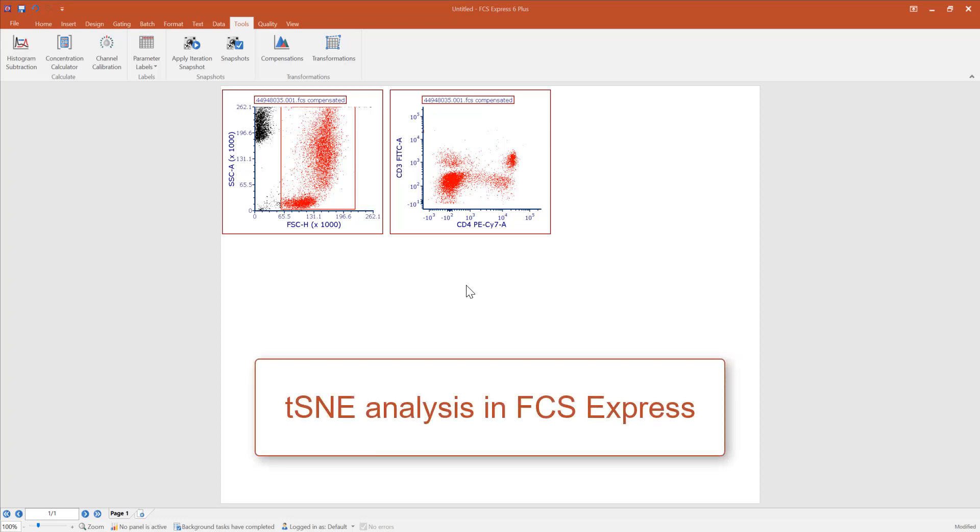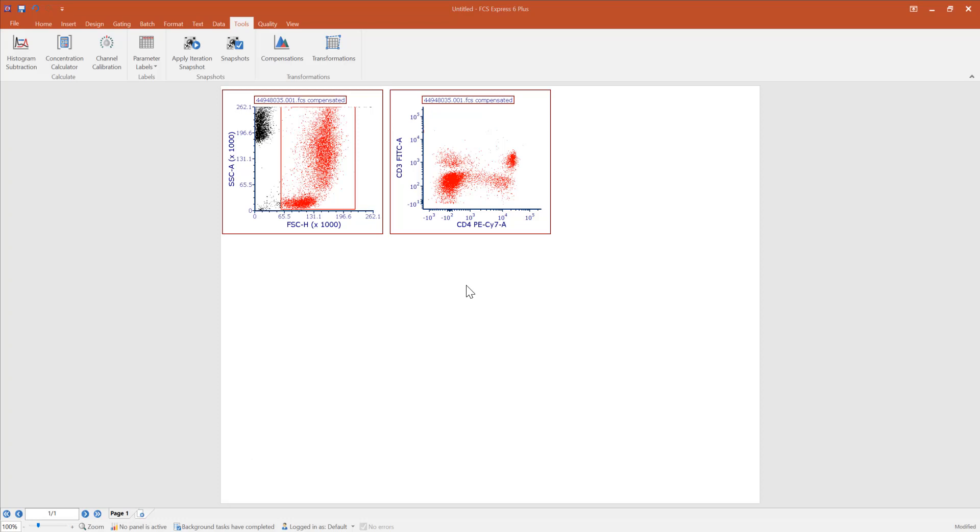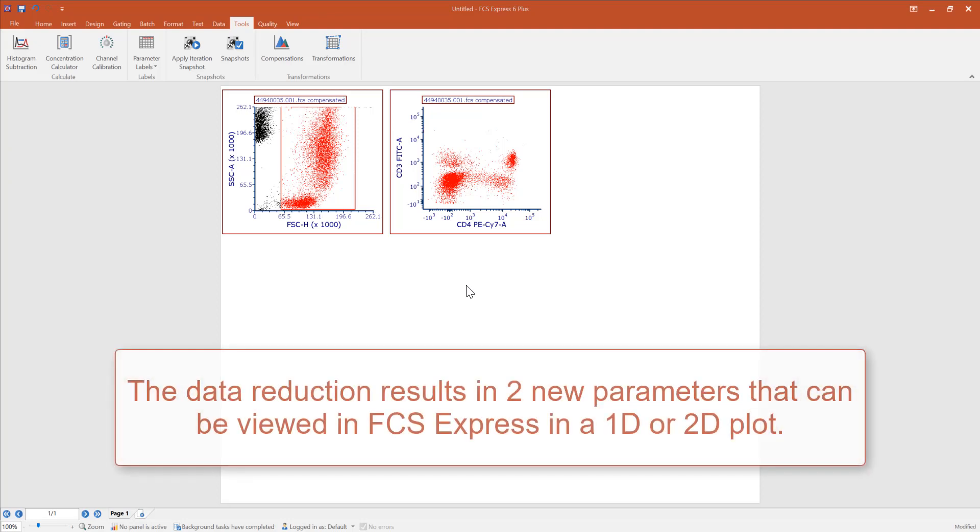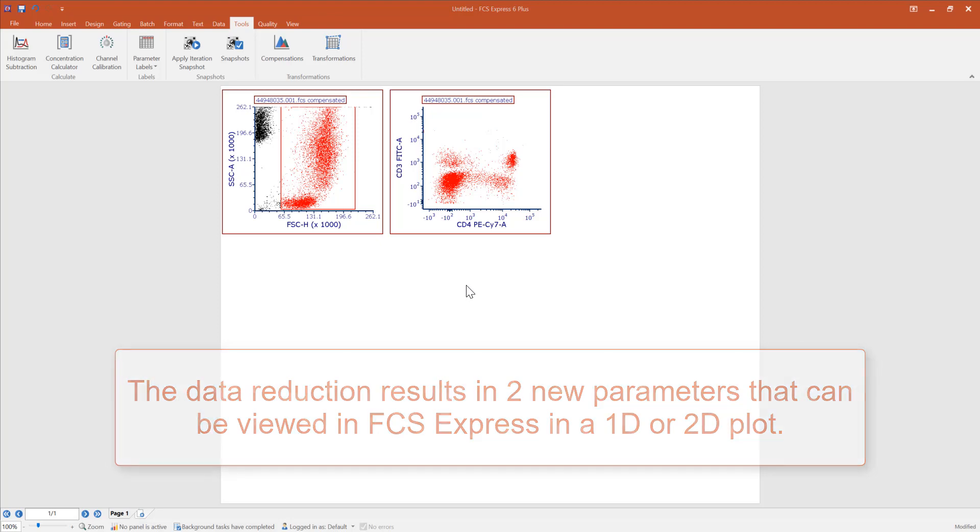FCS Express integrates T-Distributed Stochastic Neighbor Embedding, otherwise known as t-SNE, which is a tool that allows you to map high-dimensional cytometry data on a two-dimensional plot while conserving the original high-dimensional structure to help you visualize and analyze high-dimensional data.